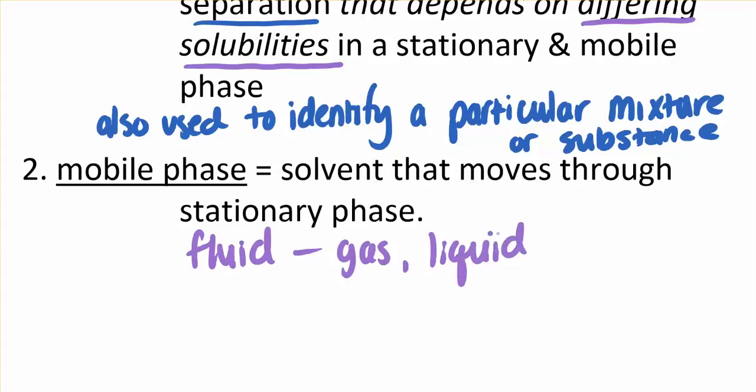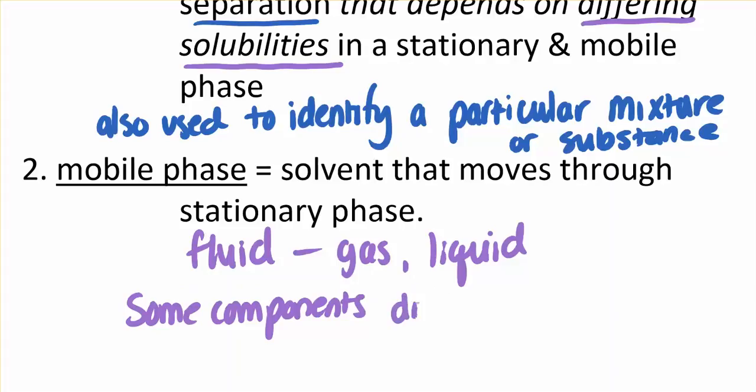So the way this works is that some components of the mixture you're testing will dissolve better than others.